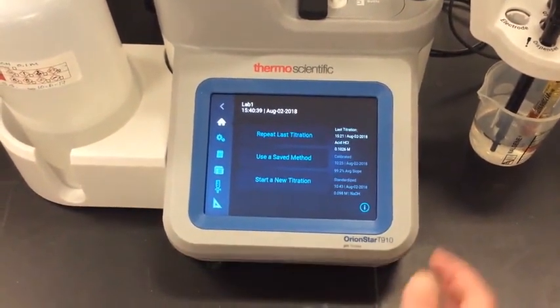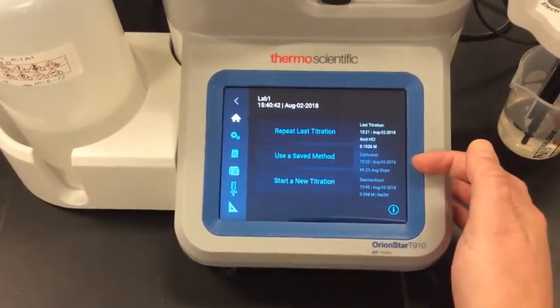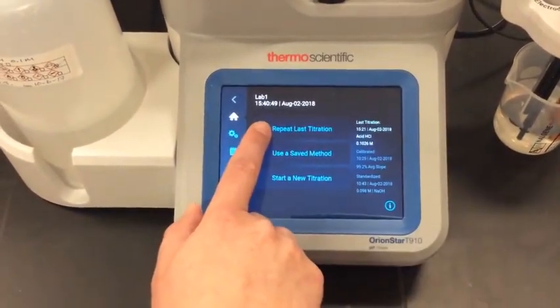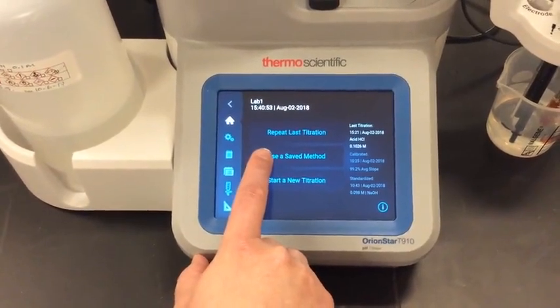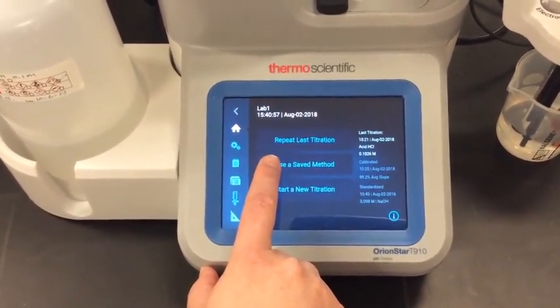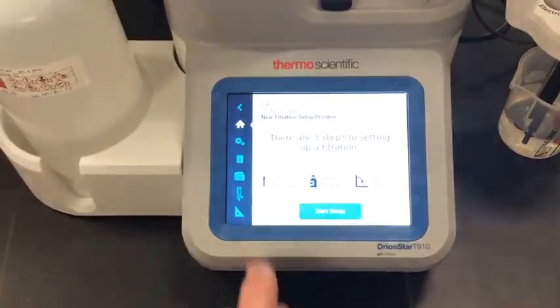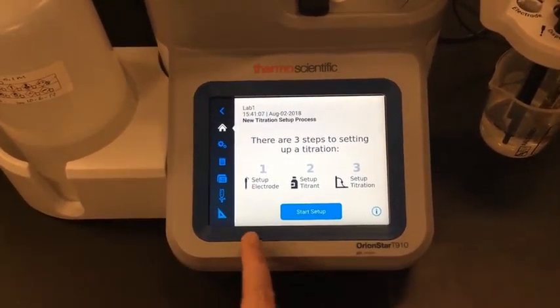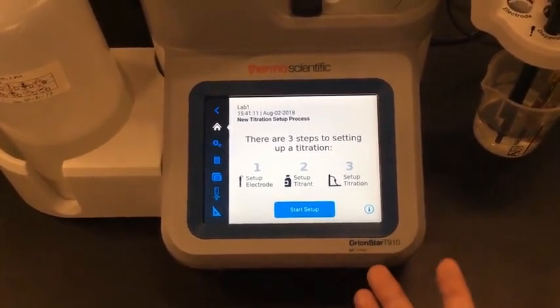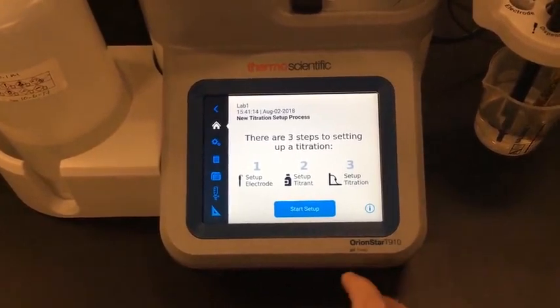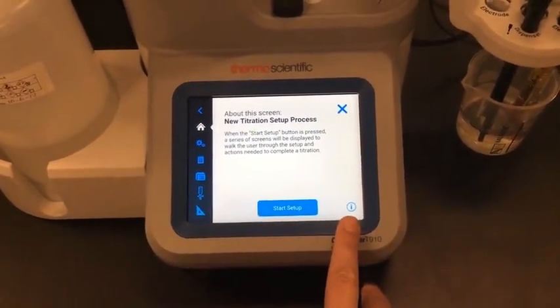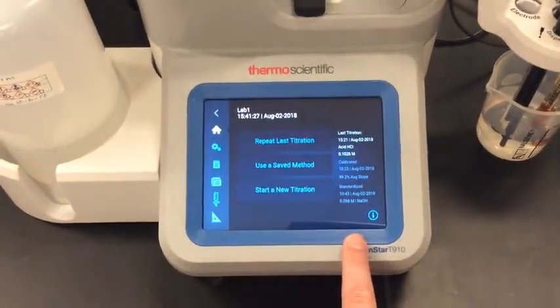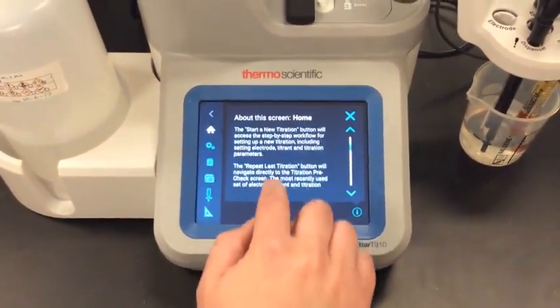On my home screen, I can see my last titration data, my calibration data, and my standardization data — so I know that all of this information is what will be used if I press the repeat titration button. I can also use a saved method to access a different method in case I want to measure a similar but different sample, or I can press the start a new titration button and start a whole new titration using the titration setup wizard, which walks me through my electrode settings, titrant settings, and titration settings, and then lets me save it as a method. I can also at any time press the info button if I'm confused or need assistance, and the titrator will tell me about the screen and give me helpful tips. This info button is available on most screens and provides valuable information as you learn your titrator.